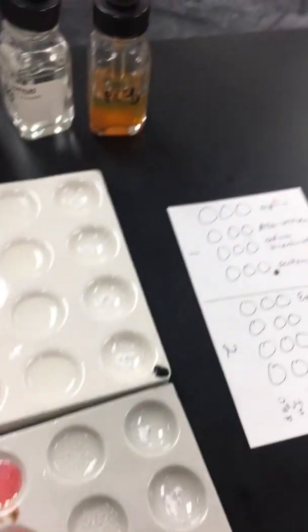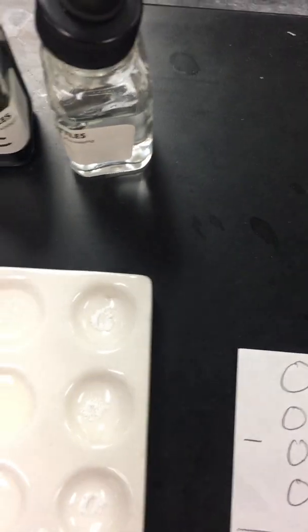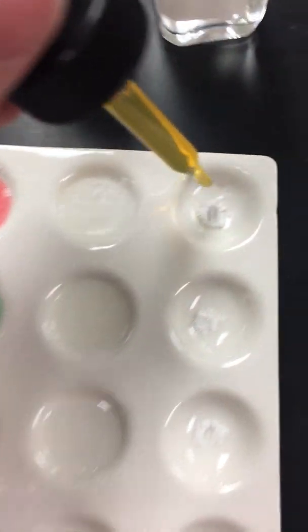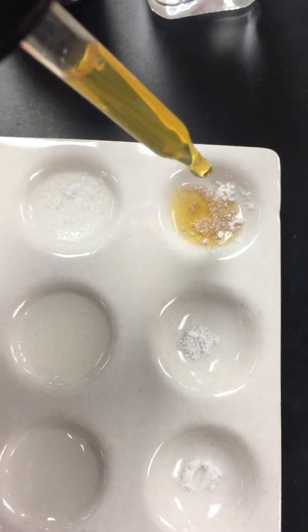All right, so then the last test is the iron chloride test. There we go. All right, so we're going to add iron chloride to this.